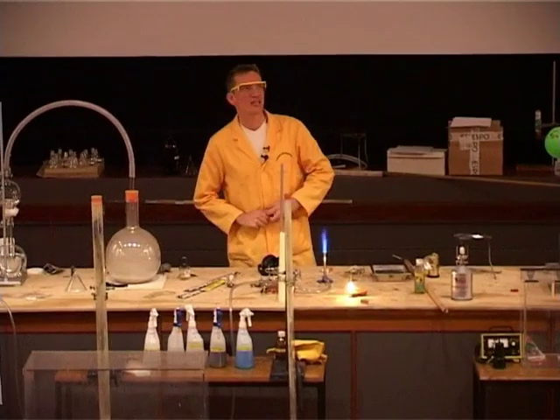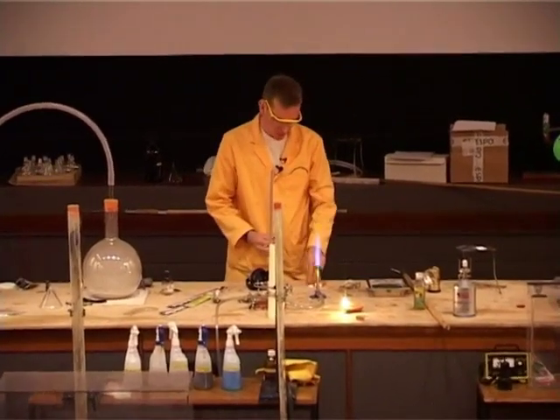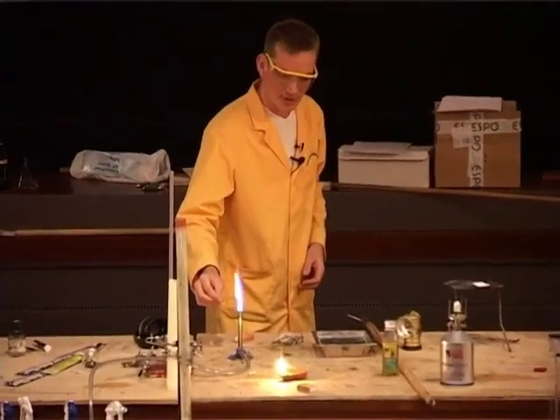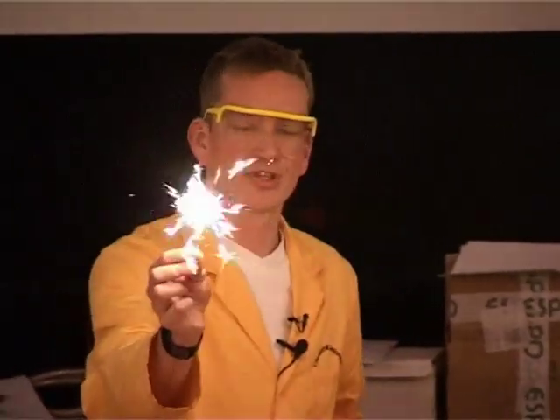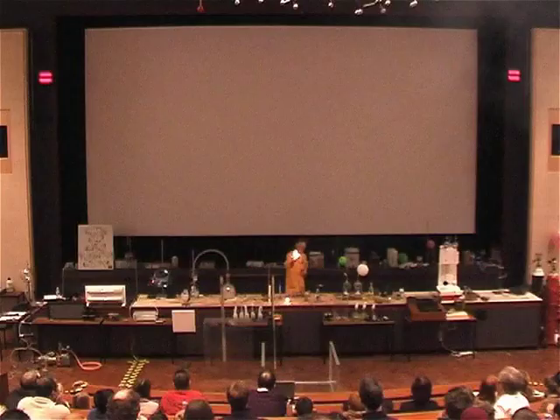You may well have seen other metals combining with oxygen. In fact, on November the 5th, you would probably be noticing these. Here we have a sparkler, and this is, of course, burning iron. These little sparkles that we see from the sparkler are due to iron filings that are heated so hot they glow.